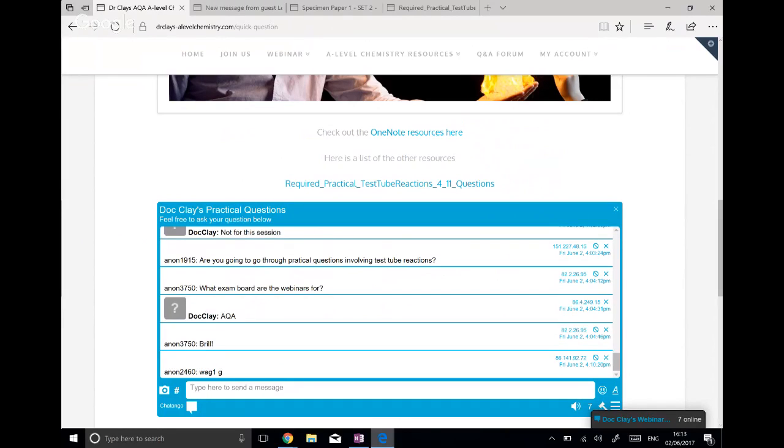Okay, no other questions at the moment. We'll move on and have a look at testing for ammonium ions.